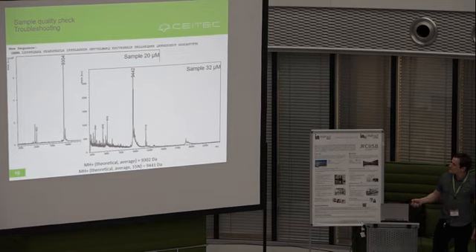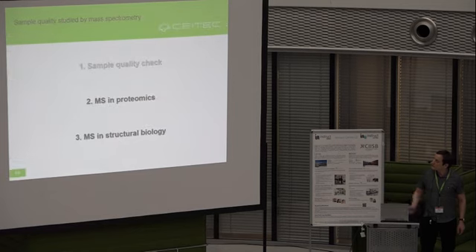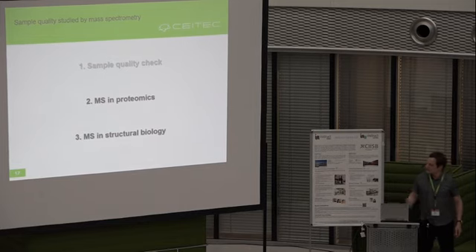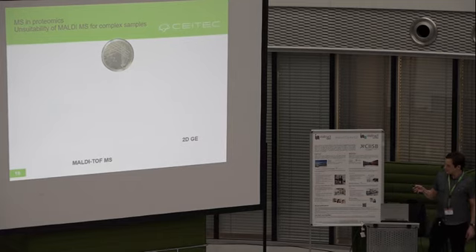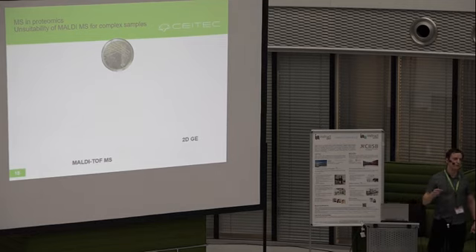So now we will leave the simplest setup of mass spectrometry, and I will try to show you in the following section what deeper insight can be provided to you by mass spectrometry-based proteomics. So I will have 2 examples of analysis, but we will start again with MALDI MS. If you analyze bacterial cells by MALDI MS directly, that you smear them on the sampling target, overlay with the MALDI matrix, and just carry out the analysis.